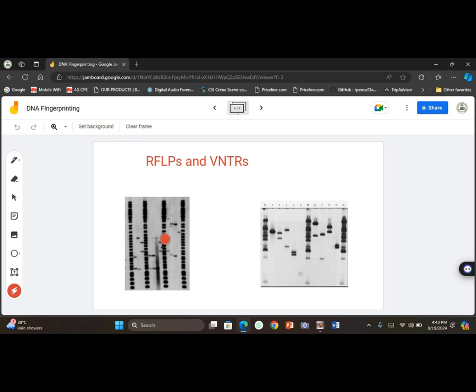The fragments are a little shorter than the RFLP pieces. So what am I saying in essence? The same method is what we are going to use for the two of them, the same approach. But what really happens in variable number tandem repeats is that we locate some specific locations in the sequence that repeat themselves in a sort of pattern.